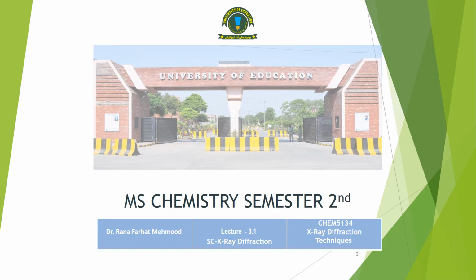Farhat, and today we are going to discuss our third chapter about X-ray diffraction technique under the course code of CHEM5134, and this third chapter is about single crystal X-ray diffraction.